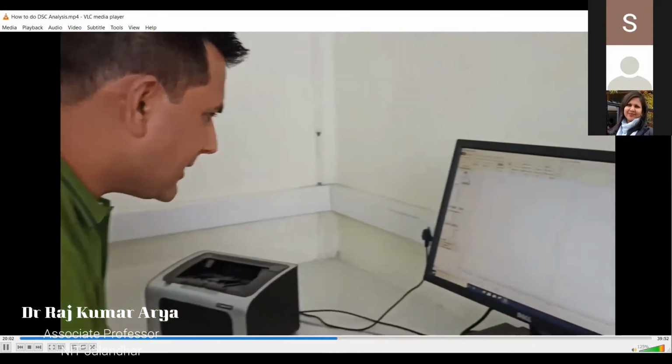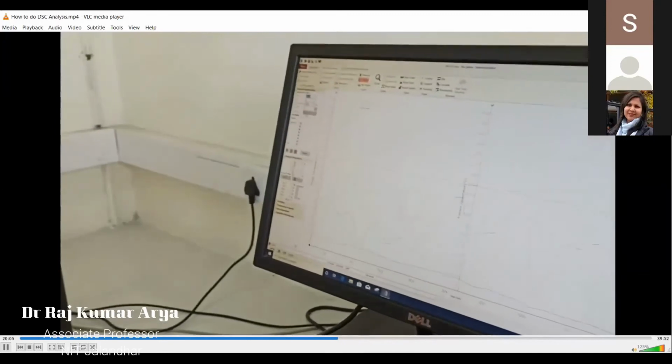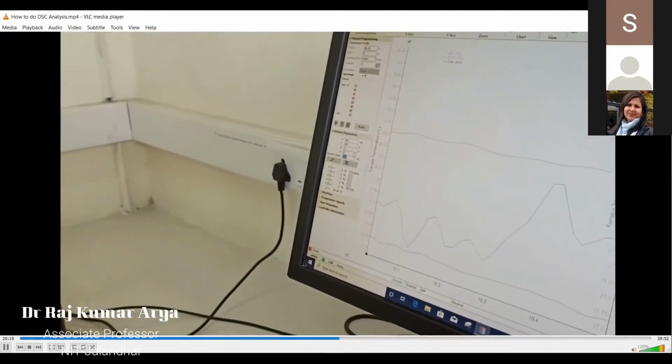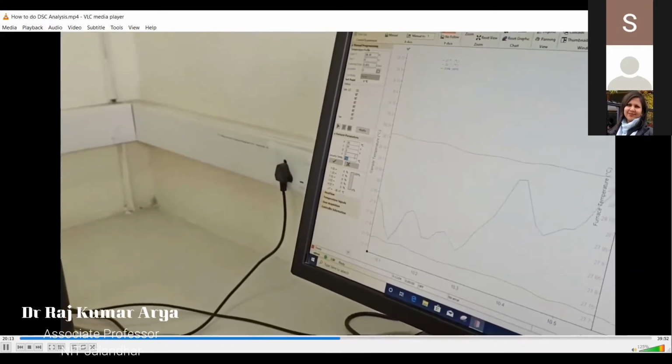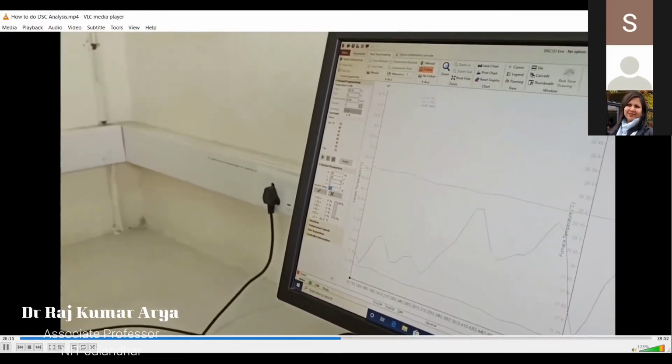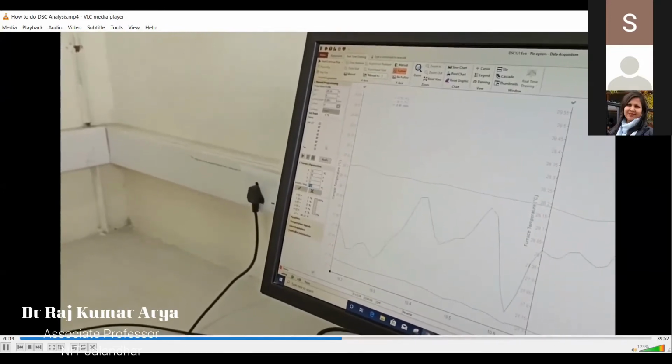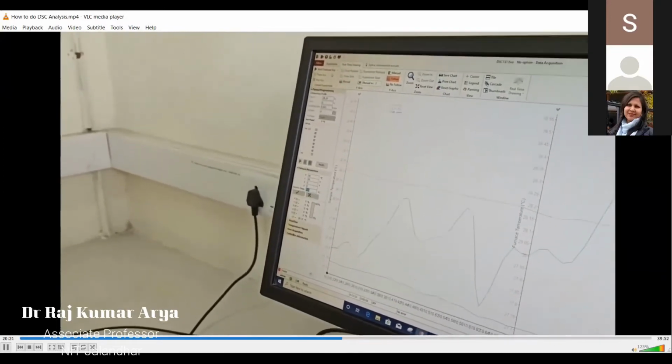Once it is done, you can see here the security temperature is clearly mentioned here, 710. We have set in the base program, earlier, 500 degrees Celsius. So this is the part you have to make sure of in the beginning.